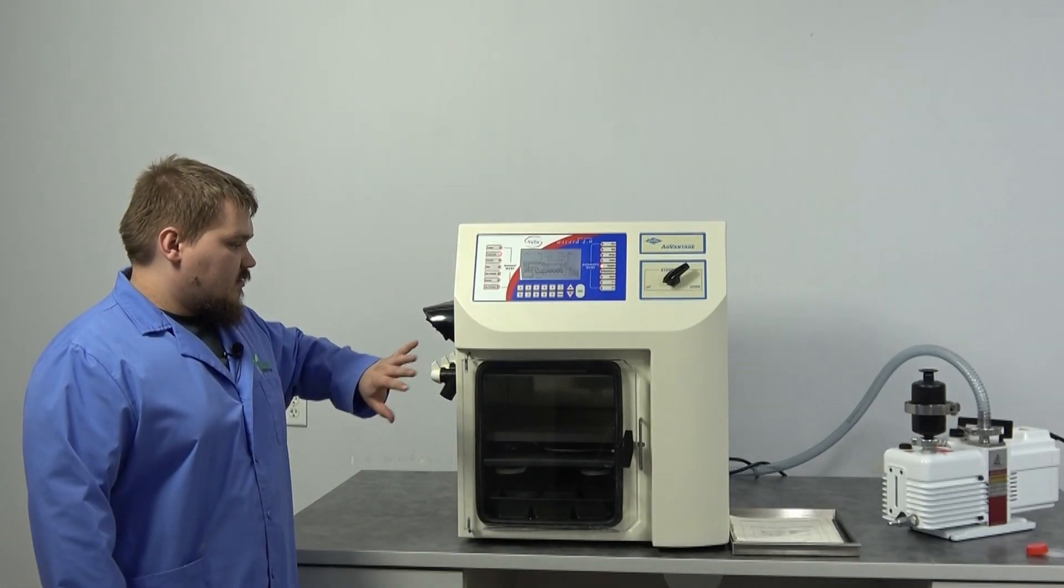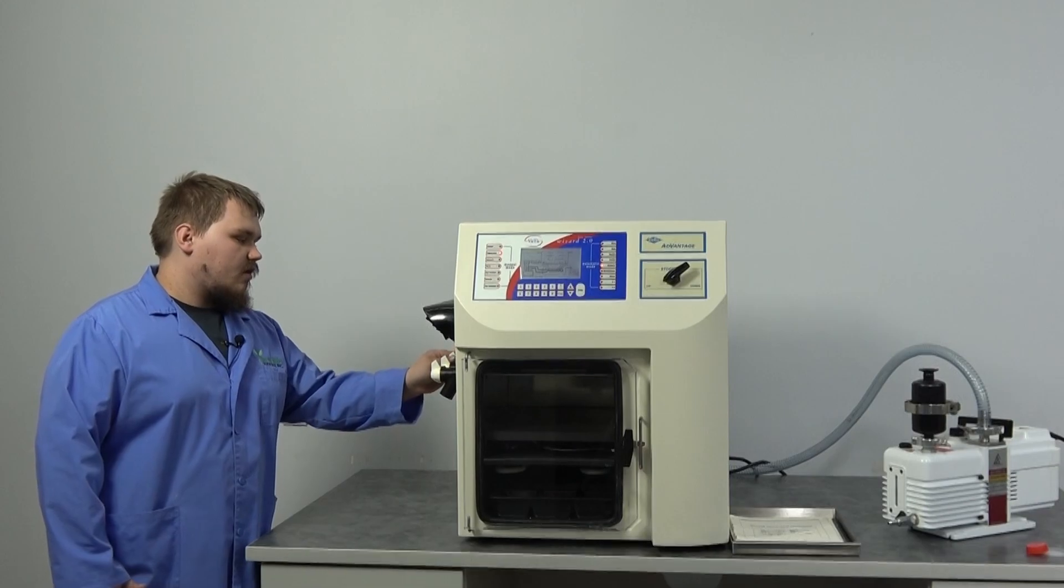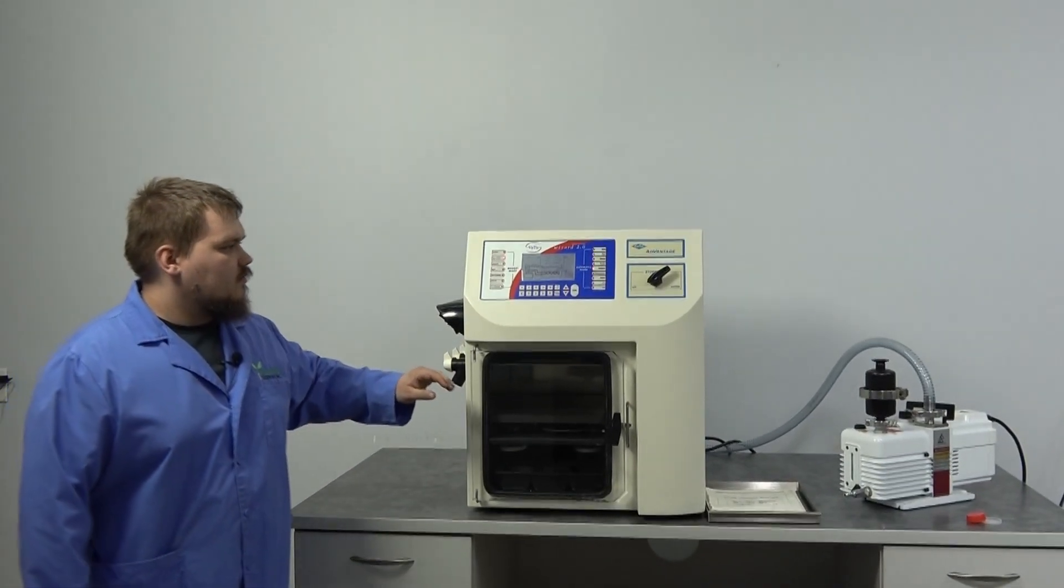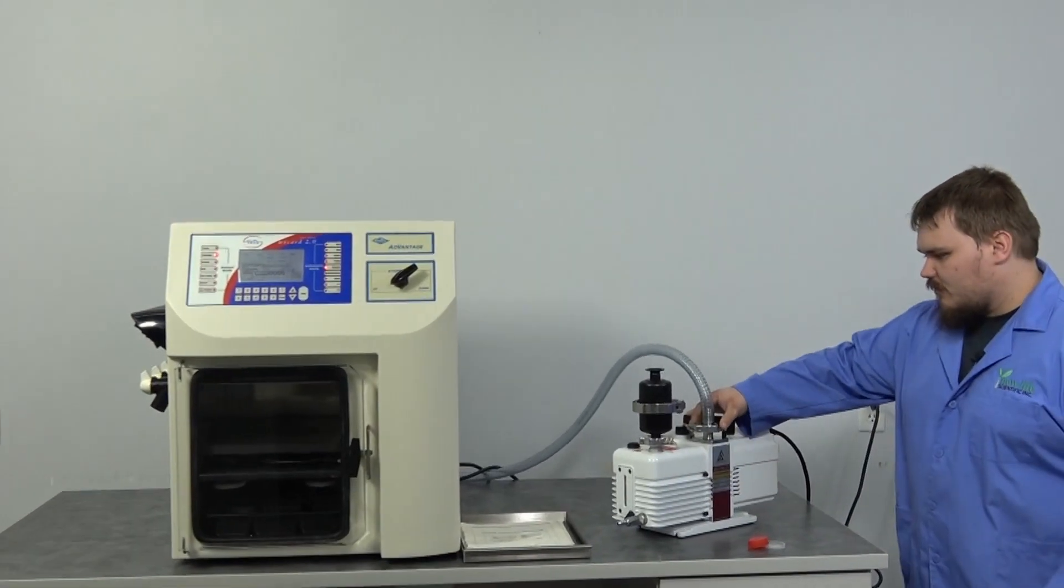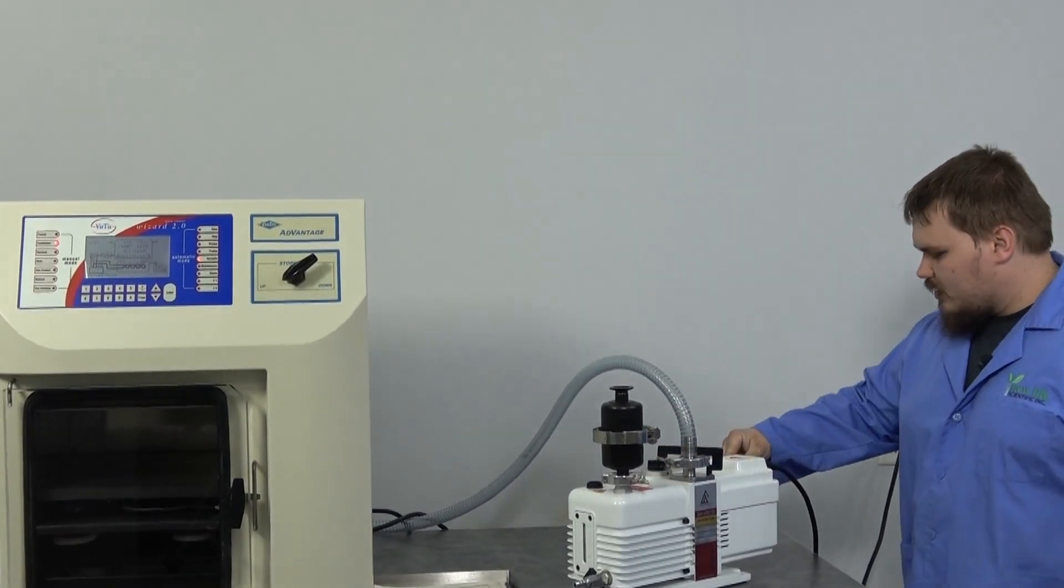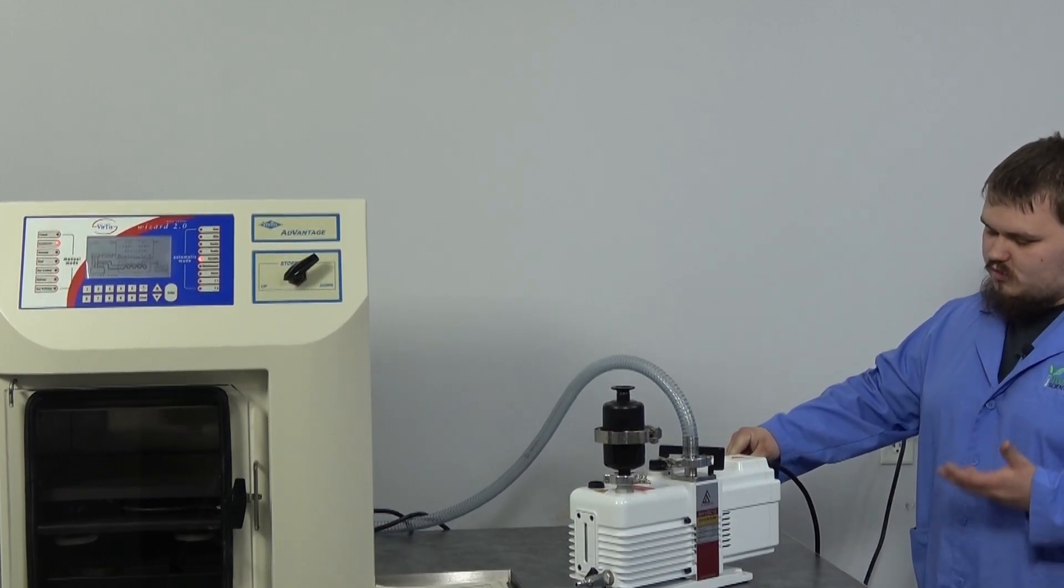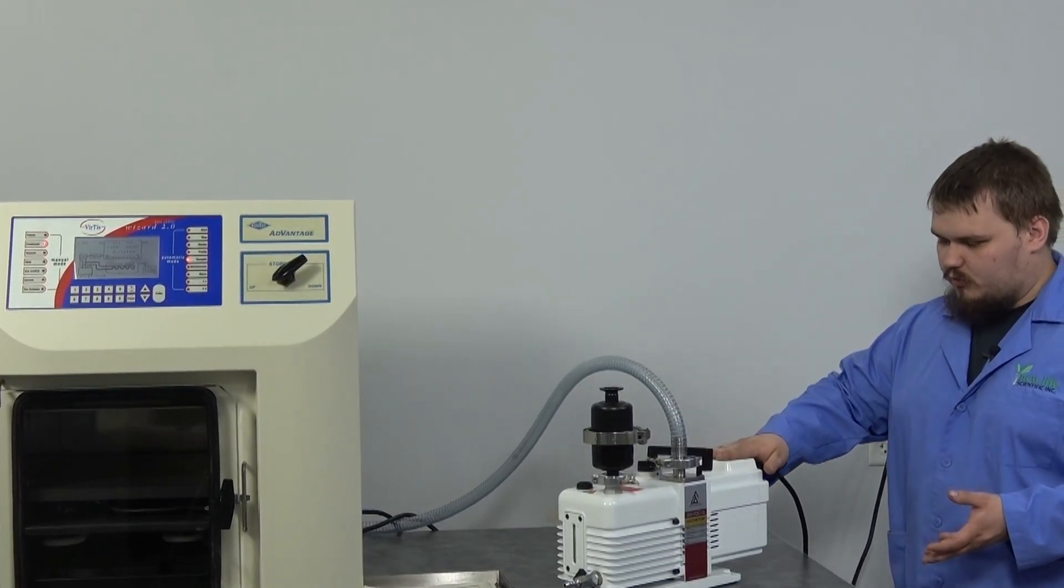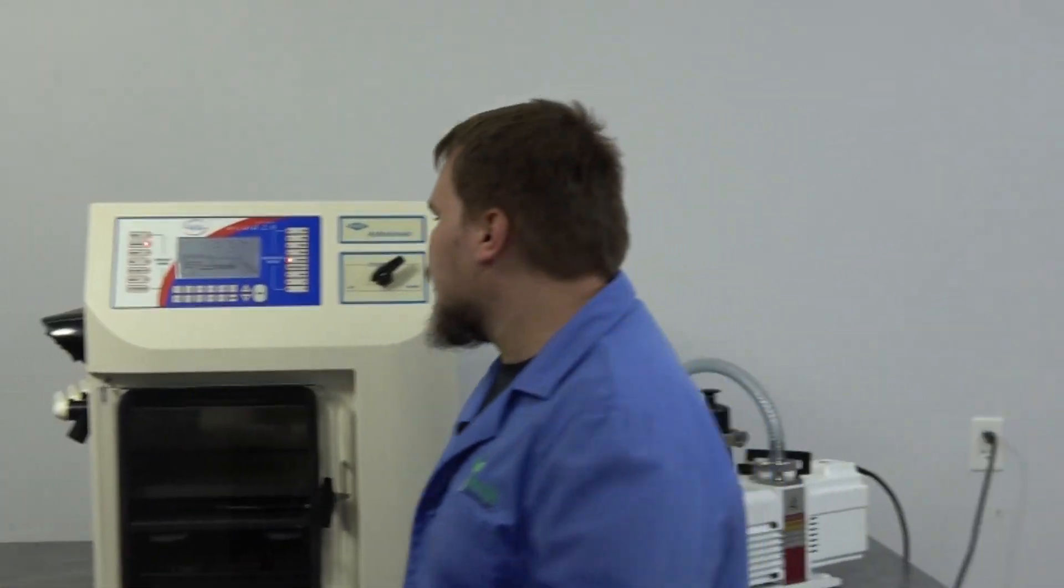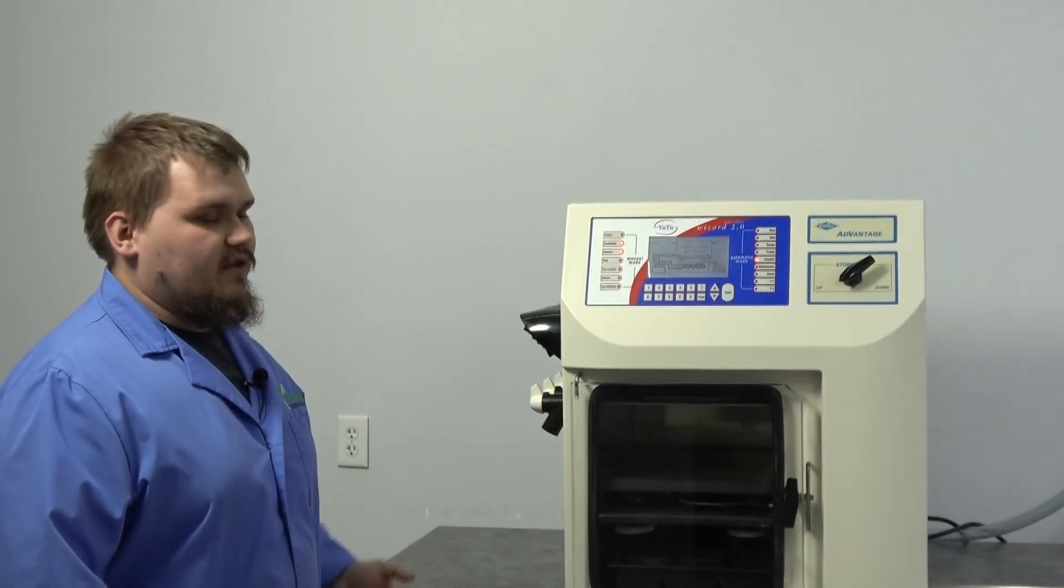Now that we've got everything there, we're going to double-check, make sure the valves are still all off, and make sure that the connections on the pump itself are still good. Make sure that the vacuum pump is in the on position on the switch. Some vacuum pumps have switches, some don't. Just double-check them. From there, we can start the vacuum.